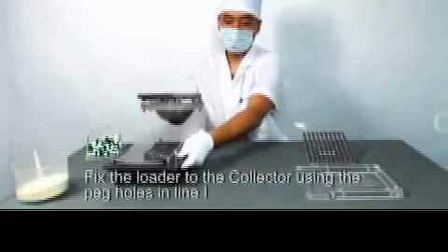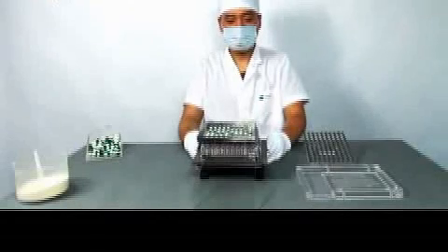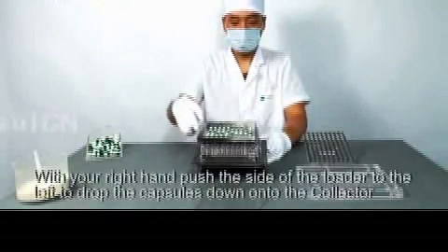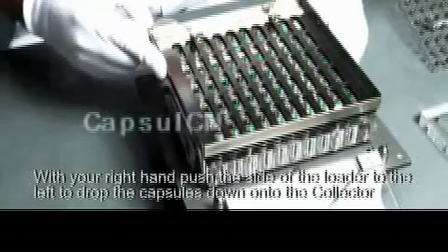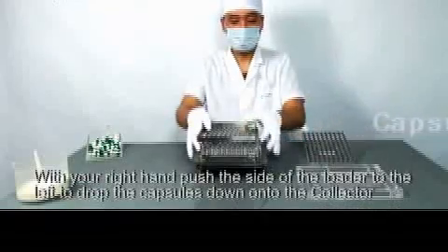Fix the loader to the collector. Use the peg holes in line one. With your right hand, push the side of the loader to the left to drop the capsules down onto the collector.